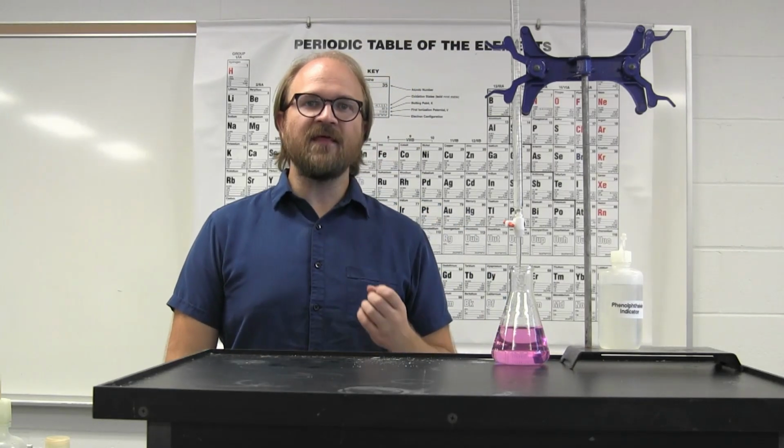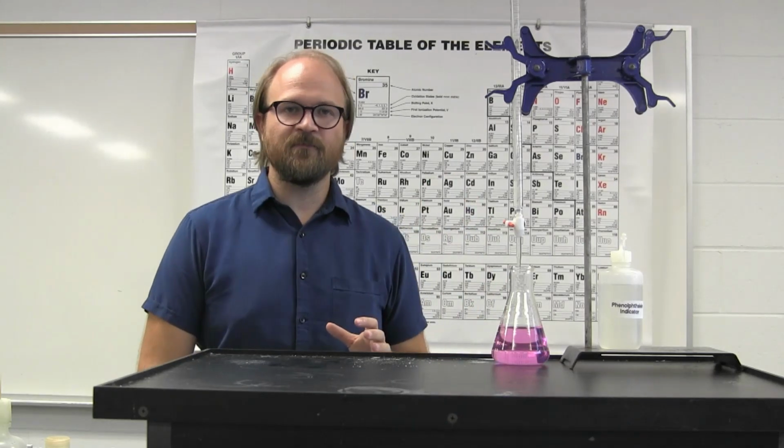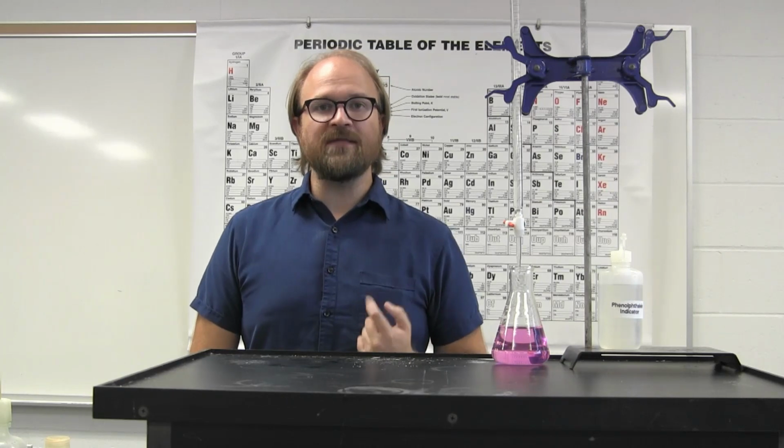In this experiment, you're preparing a solution in a volumetric flask and then standardizing it through a chemical reaction. The prepared solution would only be known out to 1 significant figure because the stock solution it started with is only known to 1 significant figure.